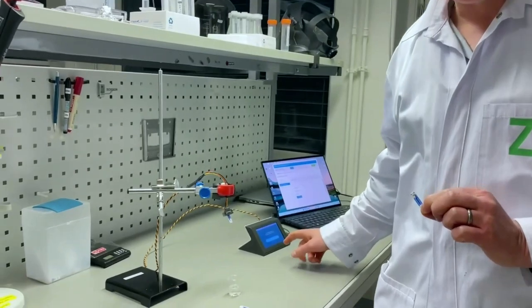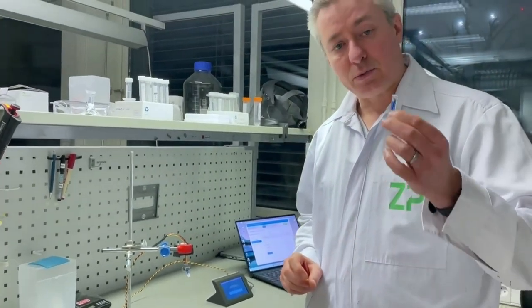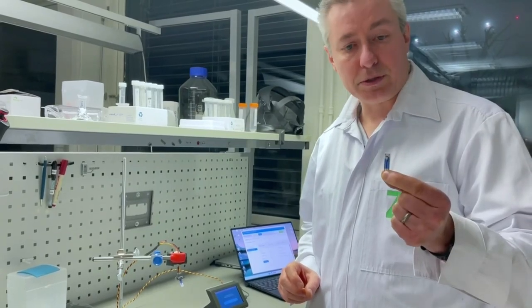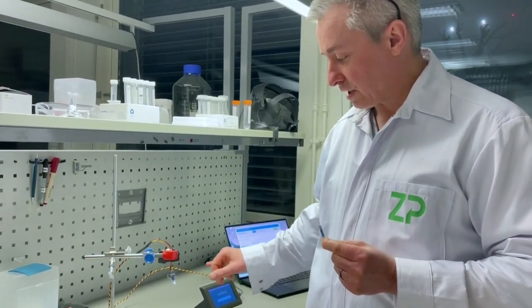What I'm going to do is give you a quick show-and-tell about screen-printed electrodes, but also about a new multi-channel potentiostat that we have at Zimmer and Peacock. What we have set up here is one of our screen-printed electrodes, which works really well with this multi-channel potentiostat.